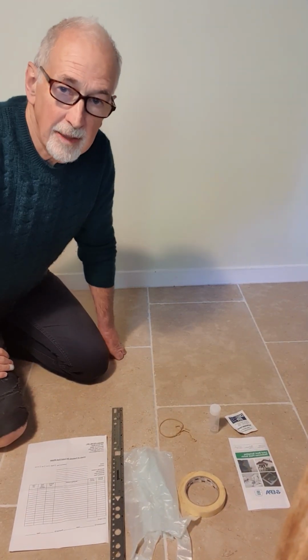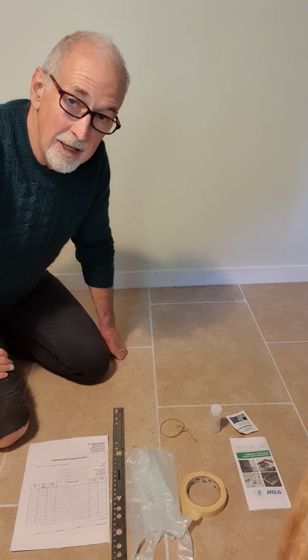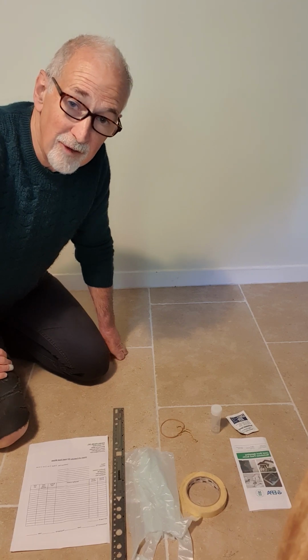Hi, I'm Tim Pye of the LEAD Alliance, and today I'm going to show you how I take dust samples for analysis in a laboratory for lead.